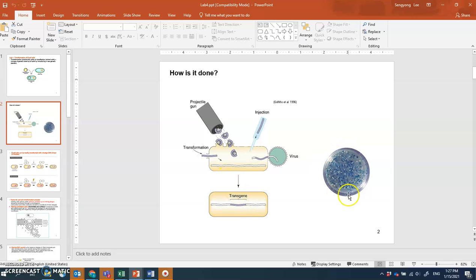Okay, so this shows a petri dish medium with a bunch of these E. coli cells. Normally this is a selective medium that contains some kind of chemical that will only allow the cells that are transformed to survive, like antibiotics such as ampicillin. Non-transformed cells cannot survive. Only the transformed can survive, because the resistance to the antibiotic comes from the genes of the element that was just transferred into the cell. So all these cells can survive because they are transformed.